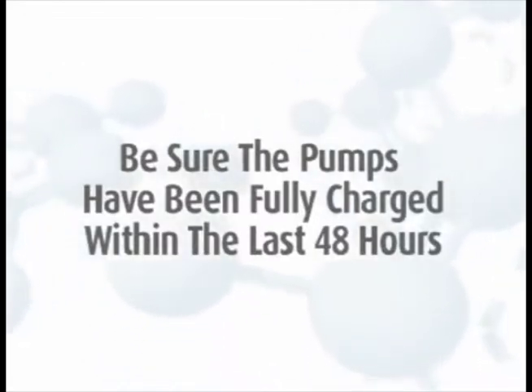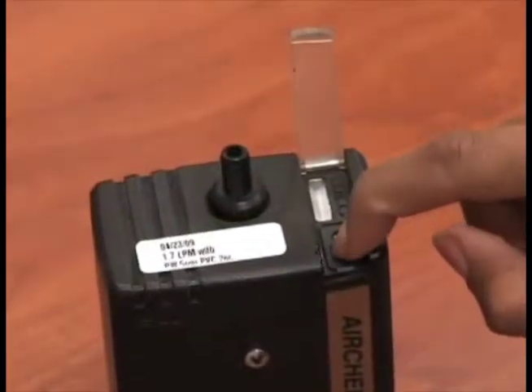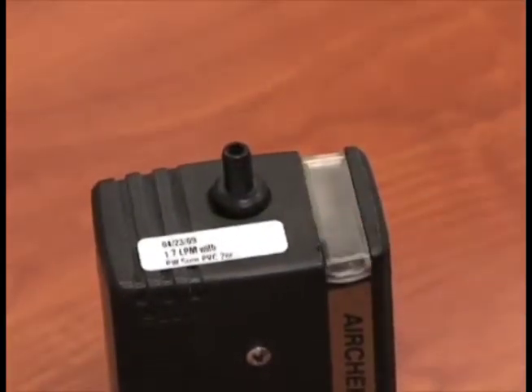To calibrate a pump with a 10mm Cyclone, first be sure the pumps are charged. If the pumps have not been charged within the past 48 hours, you must recharge the pumps prior to sampling. Start the pumps so they can be warming up. They need to run at least 3 minutes before you begin the calibration.